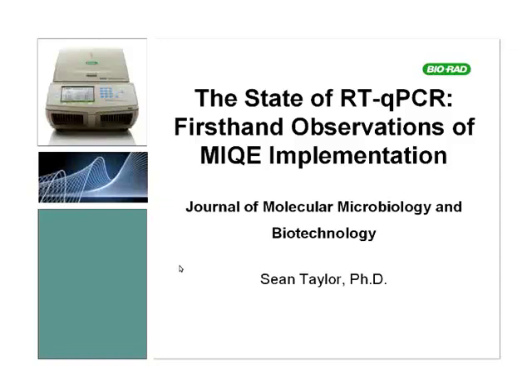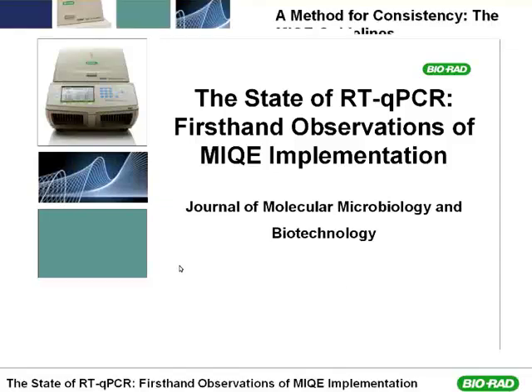Basically, this article is a very short 4 or 5 page article that will walk you through the key experimental design steps to produce really solid data for a qPCR experiment that will conform to the key criteria of the MIQE guidelines. So let me quickly walk you through this.